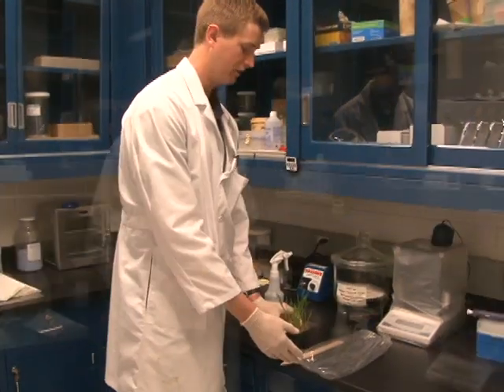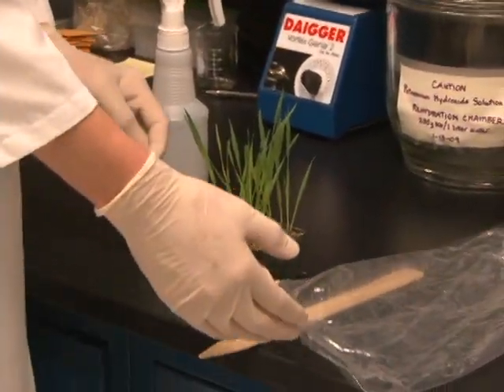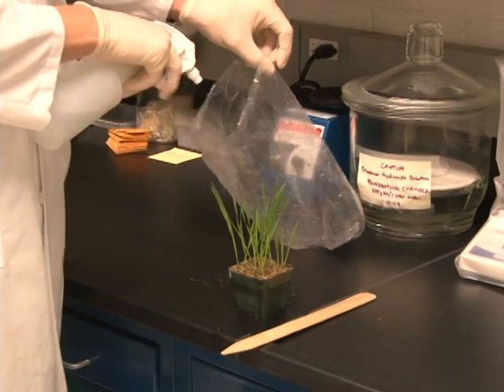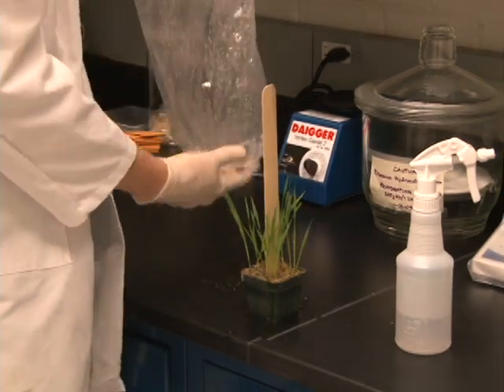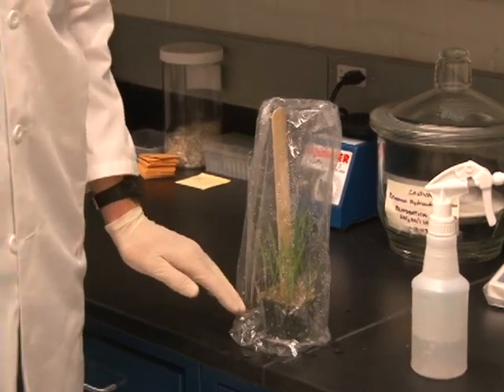A dew chamber can be relatively simple. I'm going to demonstrate how you can use a plastic bag to make a dew chamber for inoculated plants. We have this pot of plants that we would like to keep in a dew chamber. If you spray water inside of the plastic bag and invert the plastic bag over the plant, this setup will provide a dew chamber for the plants.